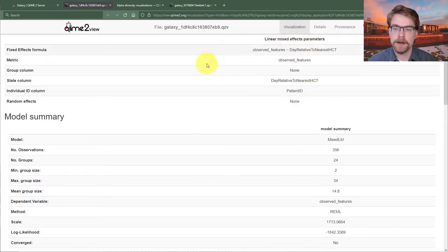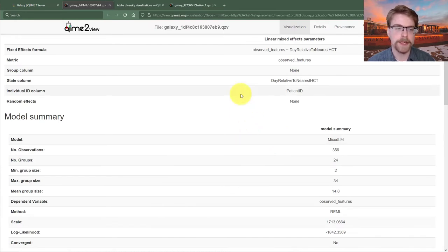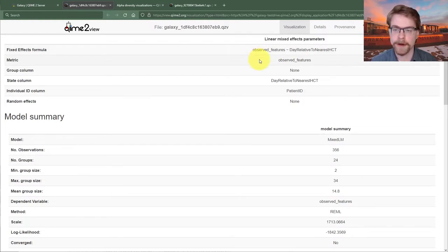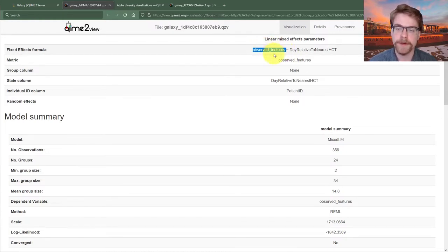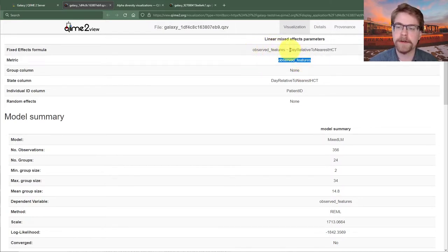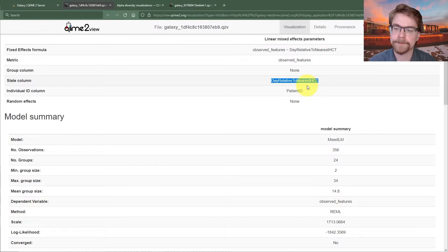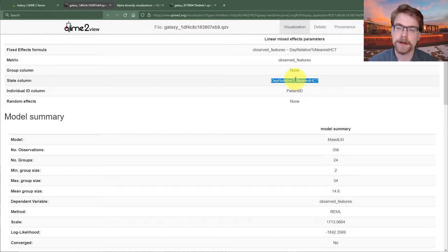We see first a lot of tables and then some diagnostic plots. Starting with our table, we have our fixed effects formula describing a normal linear model: can we explain observed features or richness on the basis of days relative to nearest HCT? The metric is observed features, we're not grouping, but we do have a state and an individual column. Our state column is our day — that's our fixed effect — and our random intercept is for each patient ID.